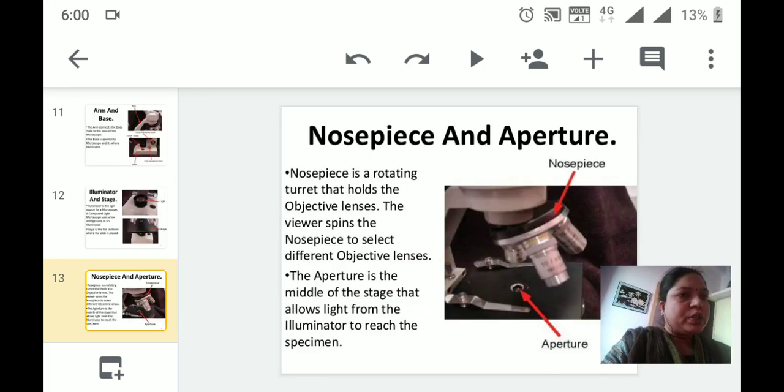Nosepiece and aperture: The nosepiece is the rotating turret that holds the objective lenses. The microscope that we are having contains three objective lenses of 10x, 45x, and 100x. The viewer spins the nosepiece to select different objective lenses. The aperture is the middle of the stage that allows the light from the illuminator to reach the specimen.